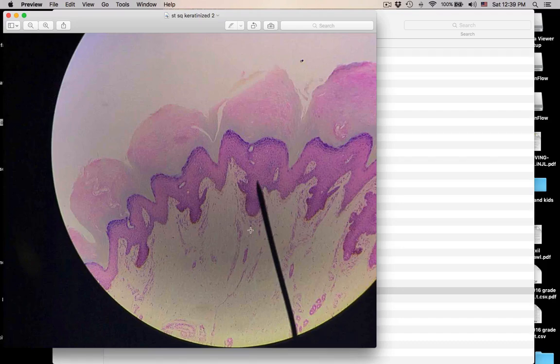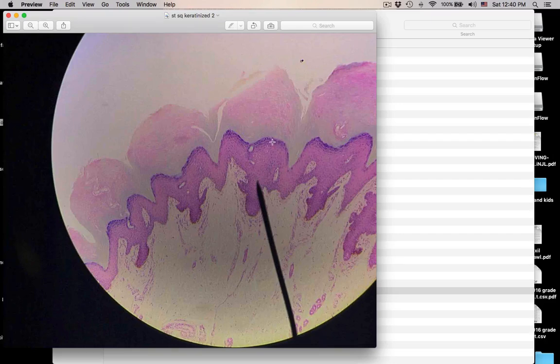Another skin slide. Again, your epidermis — stratified squamous keratinized. Stratum basale, stratum spinosum, stratum granulosum, stratum lucidum, stratum corneum. Once again, this is from thick skin.